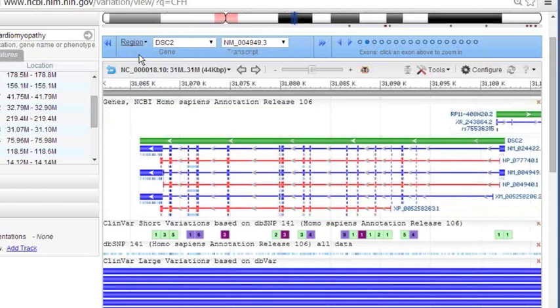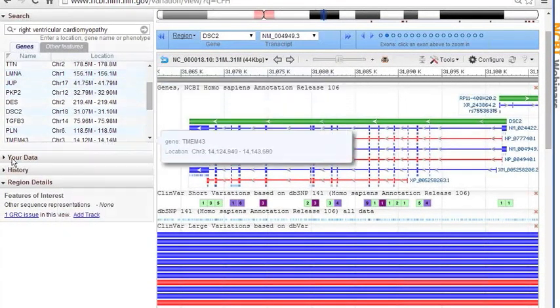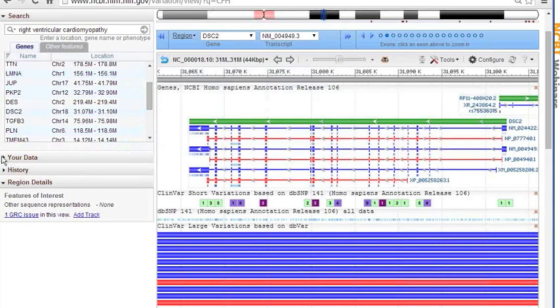Okay, let's go over and then look at some of the controls here on the left-hand side of the viewer. What we're going to do here is ultimately get down to looking at the SNPs at the bottom. A couple of things to notice while we're going there. Here's our search feature. We've already talked about that. We're going to, in a moment, upload a file. I'm going to skip over this for a minute just to go ahead down here and talk about GRC issues.